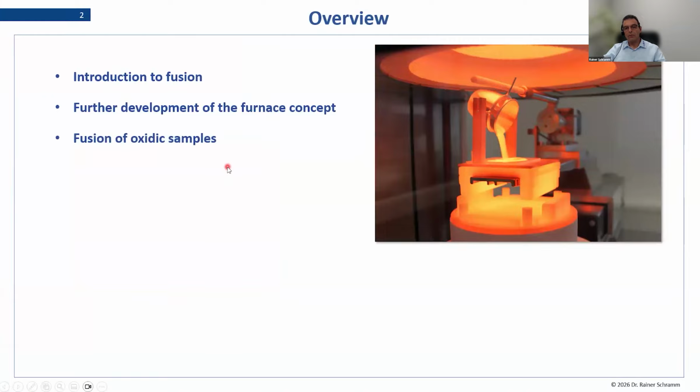Of course, I will take a few examples in fusion so that everybody understands the basics and which parameters are important for a successful fuse bead.